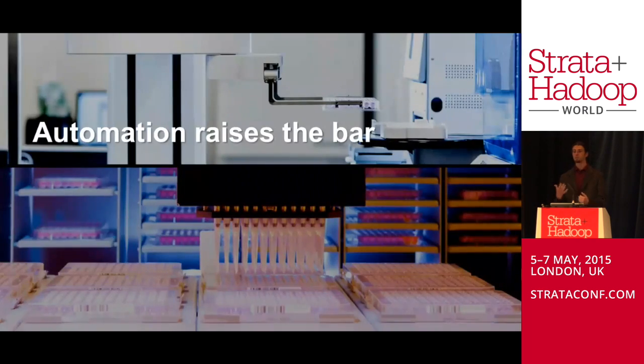For that, we need to look to an entirely different place, and that place is robotic automation. Automation raises the bar for consistency, quality, throughput, and efficiency with which we can perform our genomic changes and testing. On this slide, you can see 2 different robots that we use in our factory. On the top, you can see a robot arm that moves plates of DNA from one workstation to another. And on the bottom, you can see a liquid handling robot.